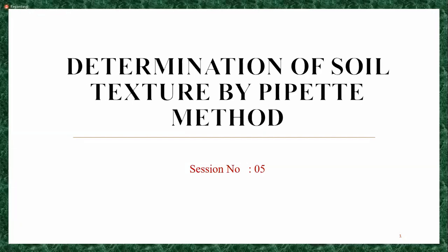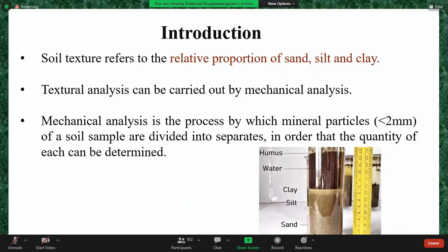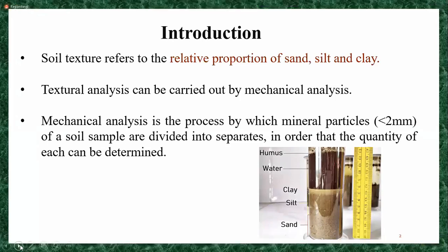Okay. Can you tell what is soil texture? That's a simple definition: relative proportion of sand, silt, and clay. So what are the methods we can use to determine the texture? You already studied one.